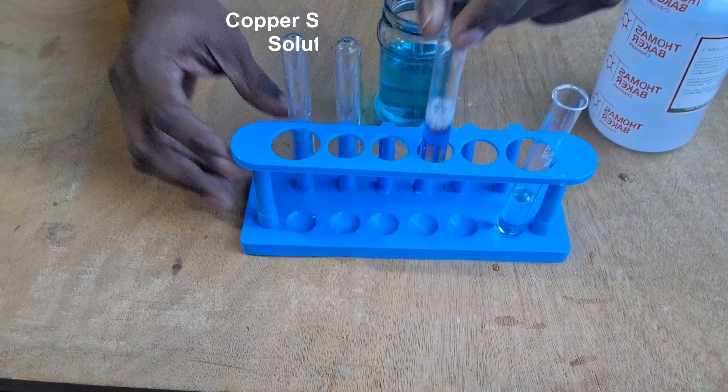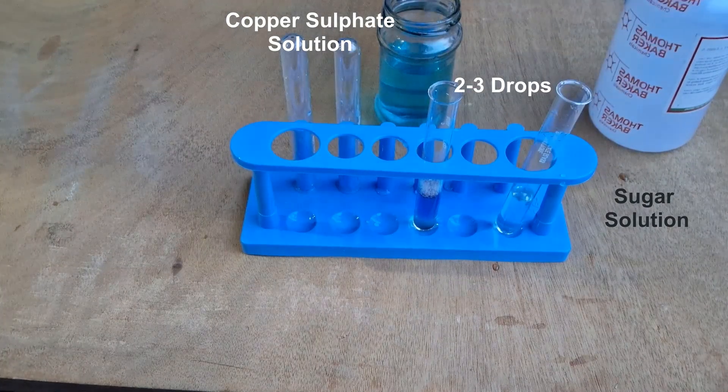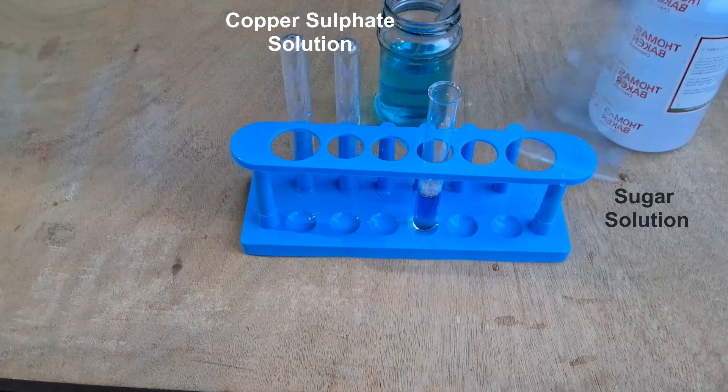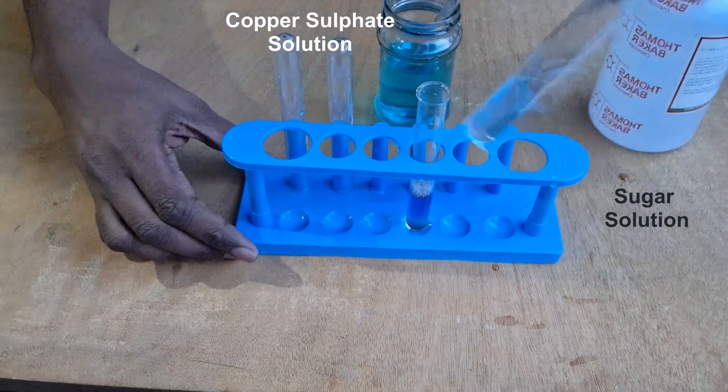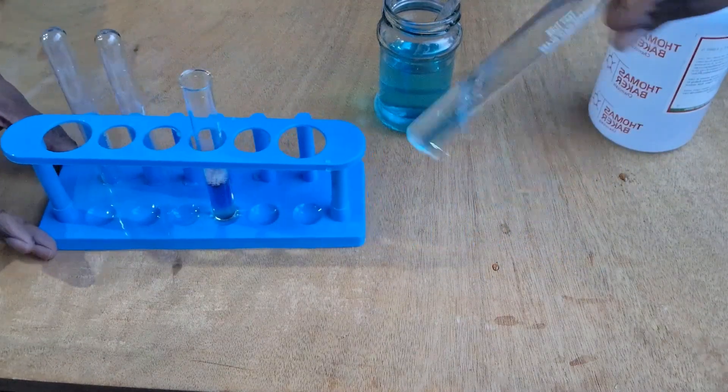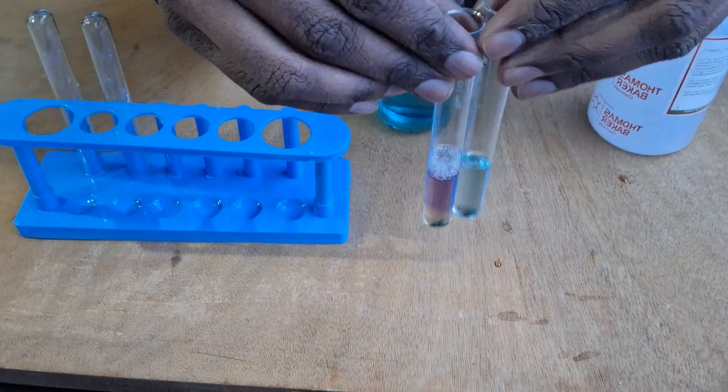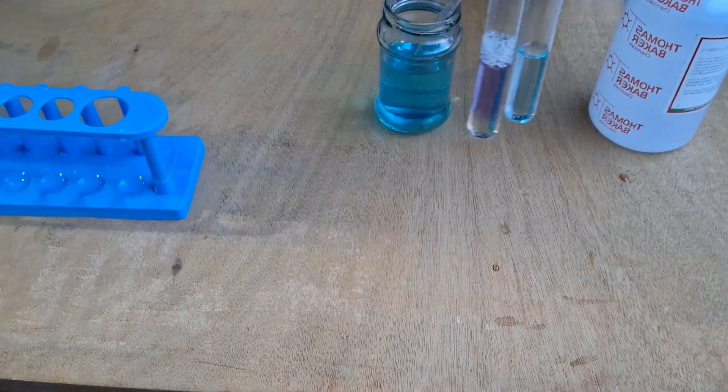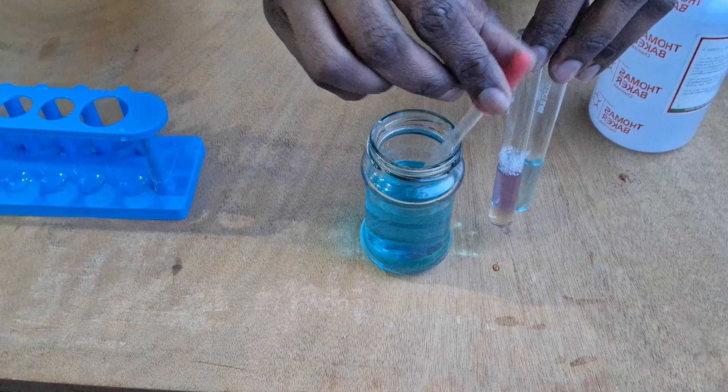Let's try the same thing with sugar solution. We'll take two or three drops of copper sulfate solution and then shake this test tube about. You'll notice that in this scenario there's no change in color.